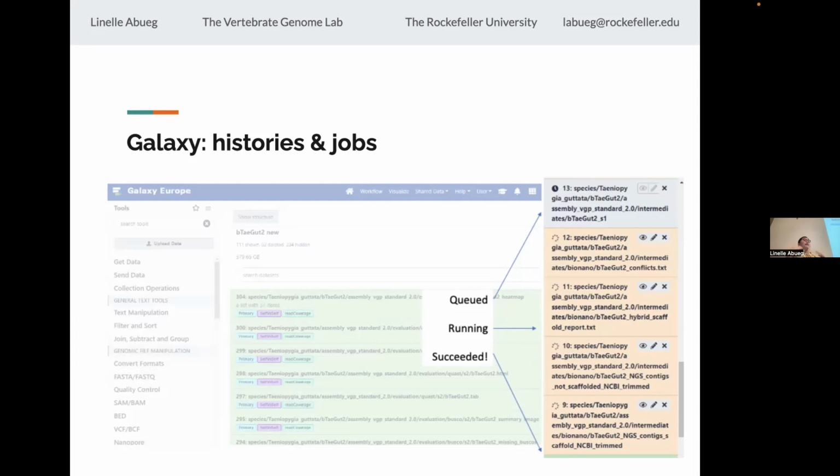So it's running on our cluster. We've set it up to run all of our workflows using our compute, because we have 28 nodes that we can take advantage of on the cluster. Prior to using Galaxy, this would look like a standard bioinformatics pipeline carried out on the command line, typing on a text-based screen through the whole entire assembly process.